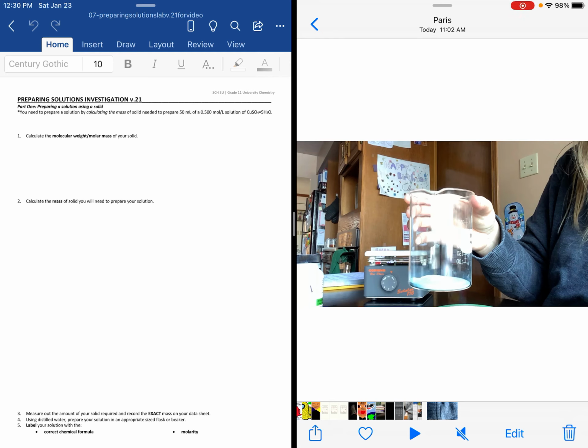Okay, so what I'm going to do is play the video I made of me doing the lab. And as we go through it, I am going to do the math on the left-hand side here. So usually in class, we would do this lab, obviously.